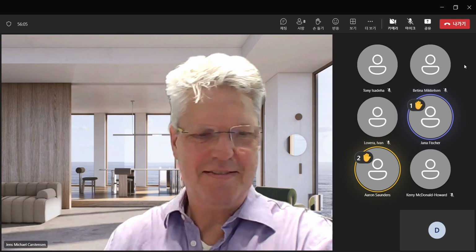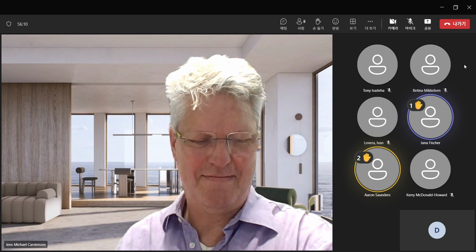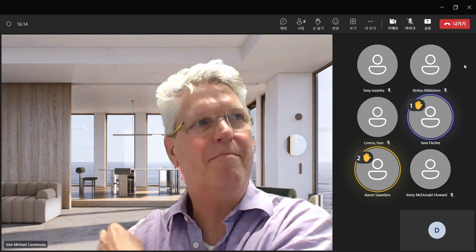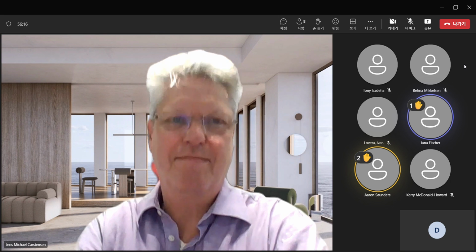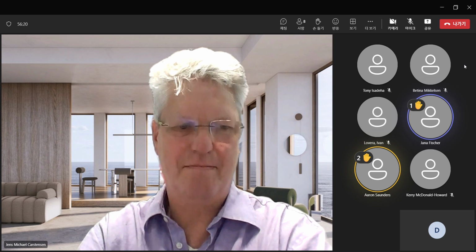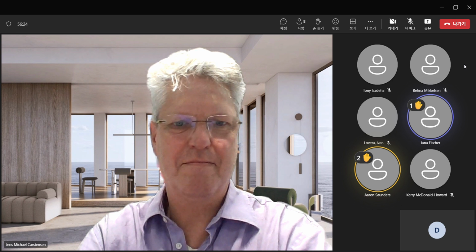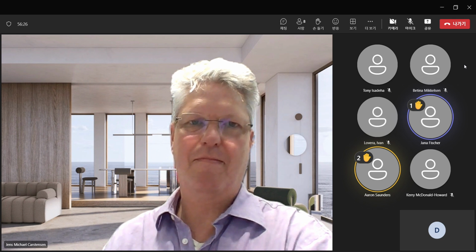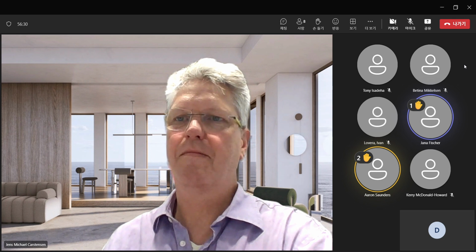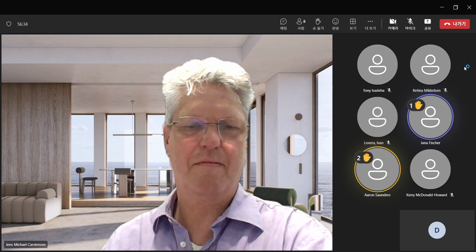We obtain the pictures, and then I like to view them under the different wavelengths, in a specific setting, may it be the jet or whatever other option you have as a view. Is that something I can also automate for a series of images that I have taken, or do I have to click myself through and export those individual viewed images one by one?